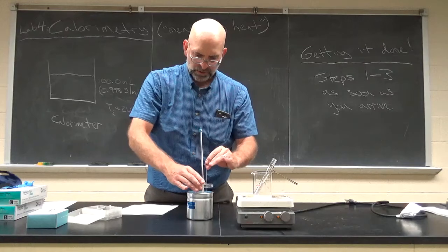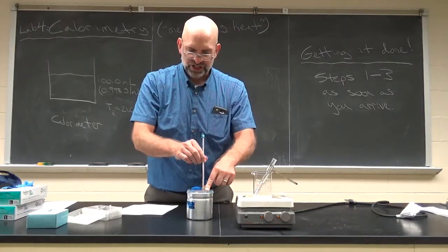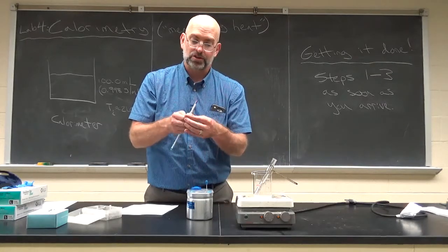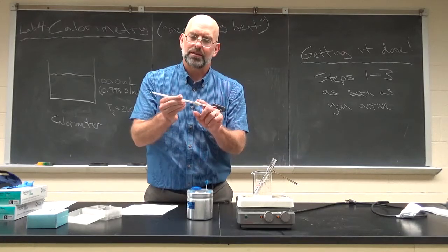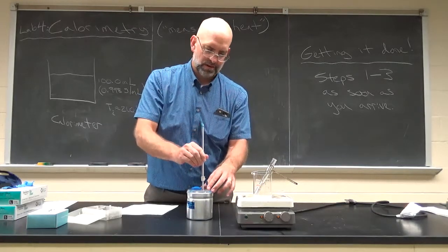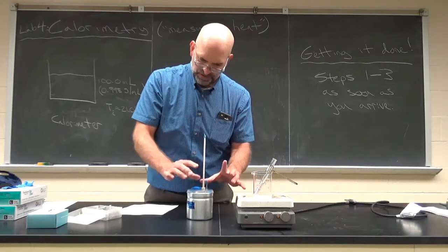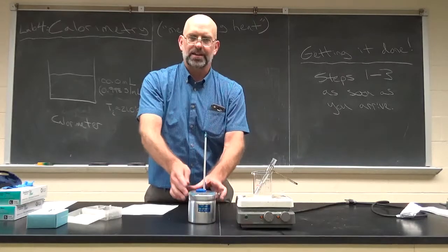The thing you want to check when you put this back together is that the thermometer is not touching the bottom, that it's suspended. And if you have to, you can ask your instructor for help. Actually, I would ask your instructor for help. These can be difficult to adjust. So I think it should be fine the way it is. Okay, so we may use this instead of the coffee cup calorimeter.